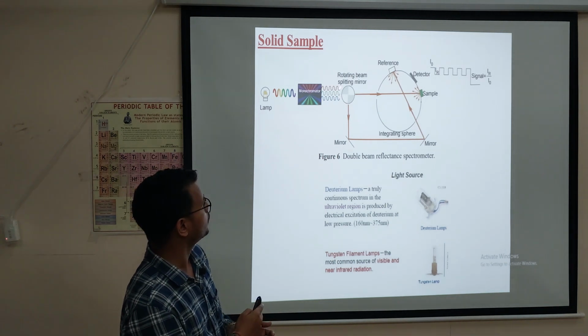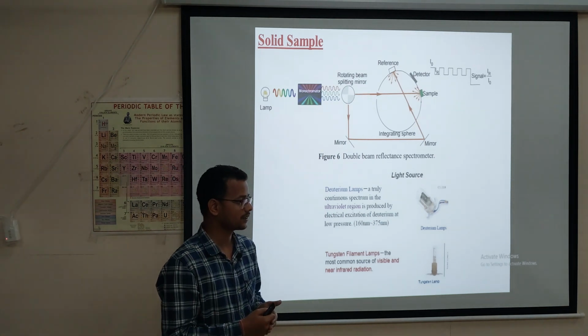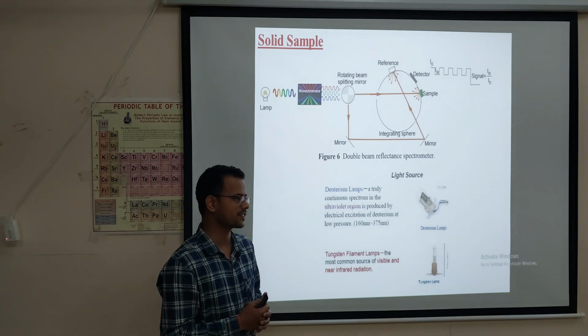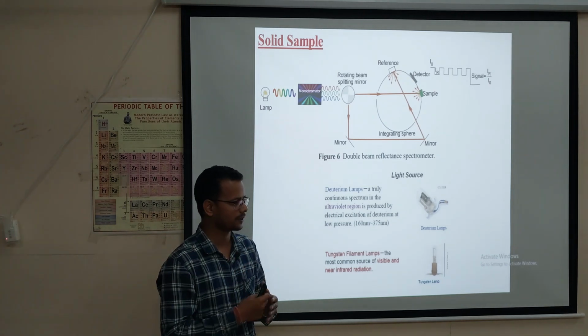Rotating beam, split mirror, rotating beam. It is a rotating beam. Okay, you asked me what the reference is in the solid case, na? Barium sulfate. No, it is solid. For solid, barium sulfate is the reference. That has been standardized on the basis of barium sulfate.